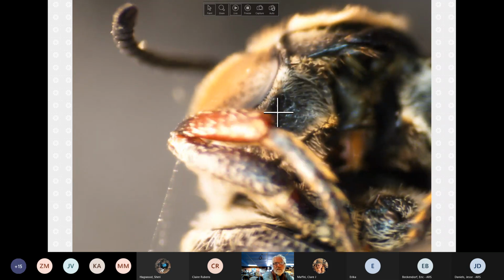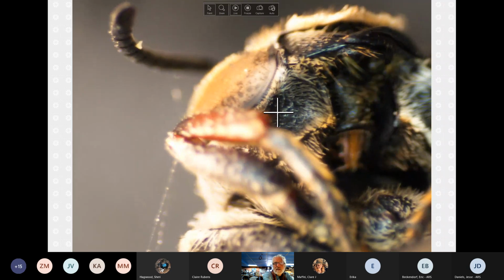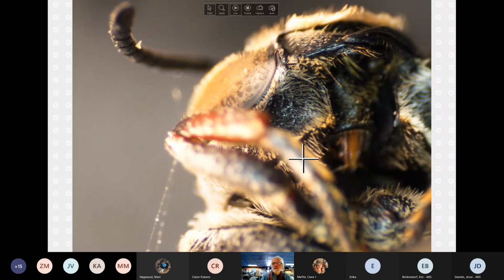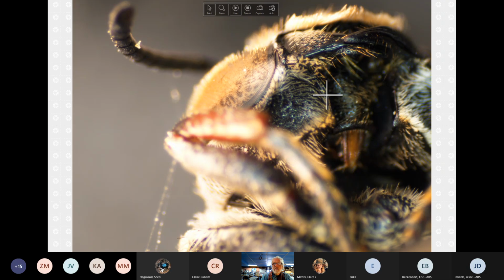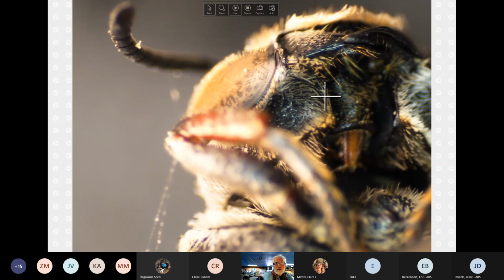I'm trying to get the darn thing in focus. And in this case, there are not a lot of hairs, but there's a lot more hair here than there were in alternatus. You can see the other hairs over there too, whether that's uniform throughout or not. This is the angle, and we're not straight up and down, but you can see where the angle would go.